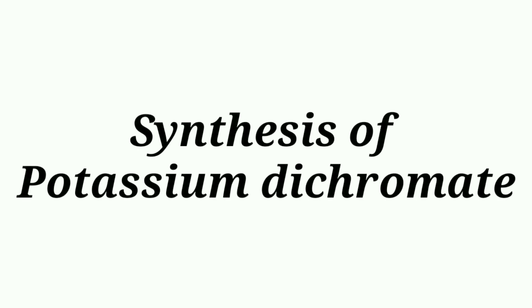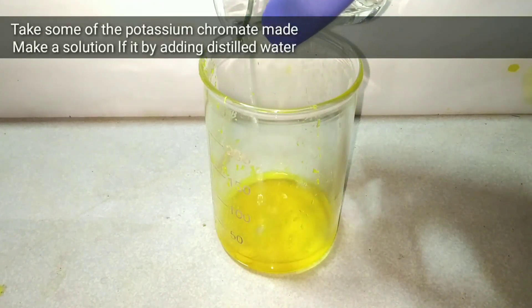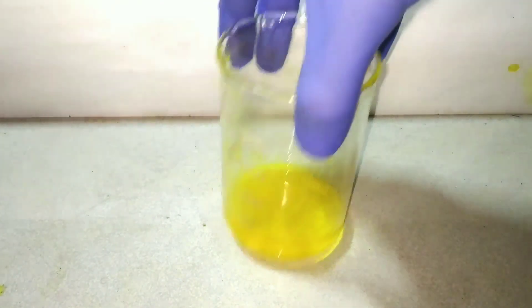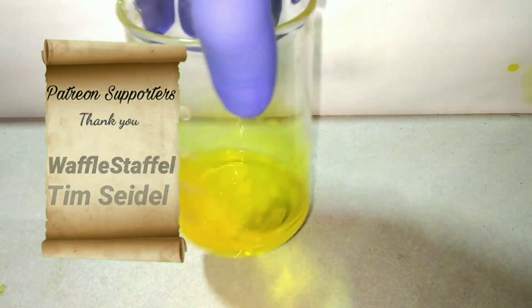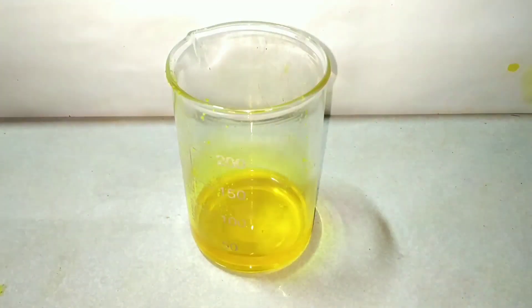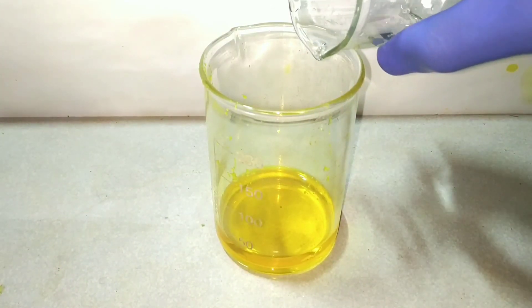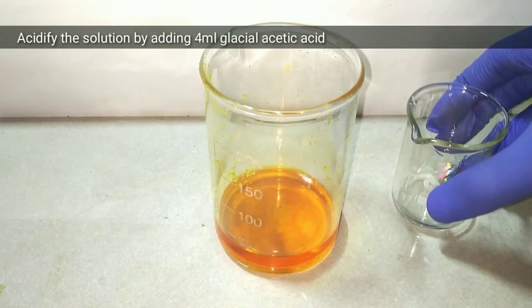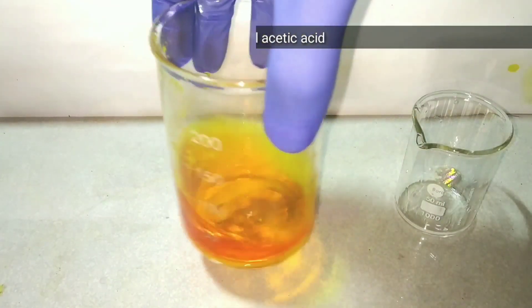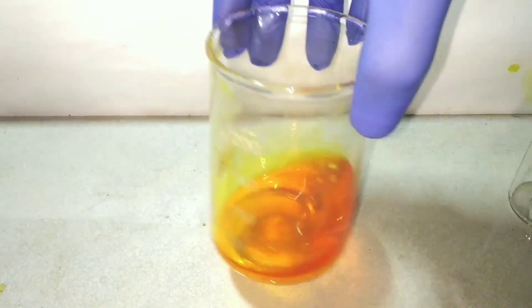Next we will be synthesizing potassium dichromate. We are synthesizing potassium dichromate from the already prepared potassium chromate. Take some potassium chromate crystals and create a saturated solution with a minimum amount of distilled water. Mix well and you will have a nice yellow solution. Now we add 4 ml of glacial acetic acid to acidify the solution. The color immediately changes from yellow to deep orange, because the chromates are converted to dichromates.